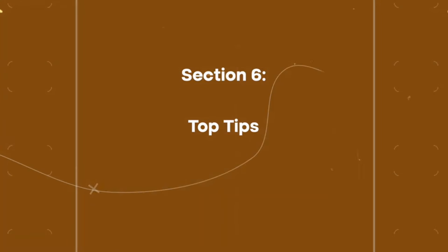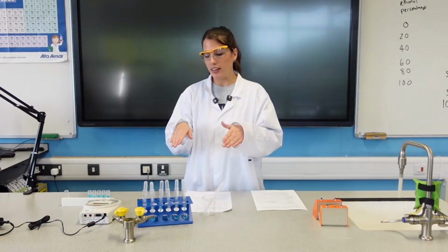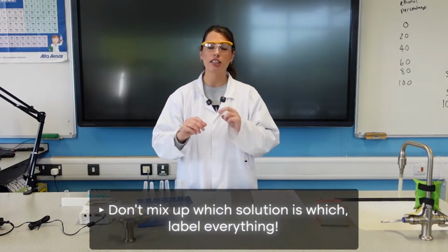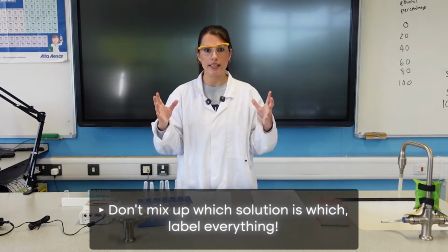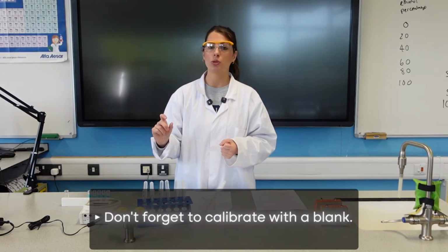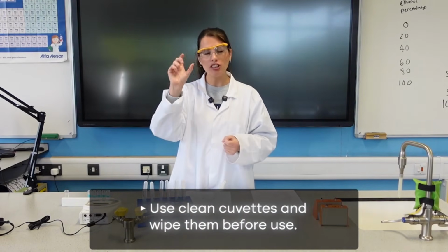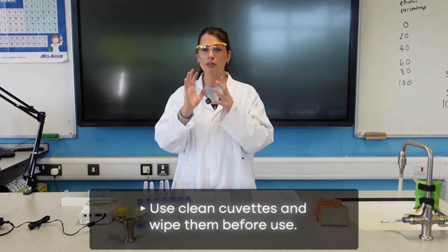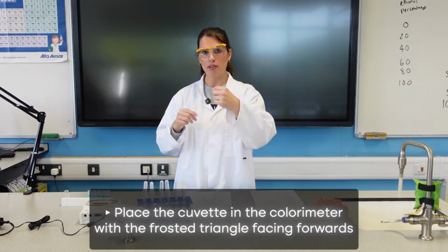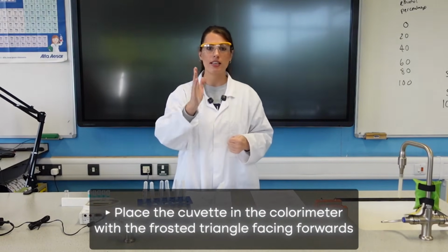So some top tips just to make sure your students are aware of in this investigation. Make sure that they do label their test tubes right at the start so they don't get them confused when they're all colourless liquids. Make sure that they do always zero their colorimeter using distilled water at the start. Make sure they're not touching the sides of the cuvettes, making them greasy and affecting the light absorbance, and that they're definitely placing it into the colorimeter with the frosted triangle facing forwards.